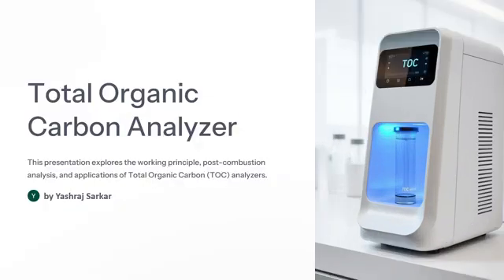Good morning, everyone. It's a pleasure to have the opportunity to present an in depth overview of the total organic carbon analyzer. So, this presentation will explore the working principles of the TOC analyzer, the detailed post combustion analysis process, its diverse applications across various industries, and technical considerations that highlight its advantages and limitations. So, let's begin by understanding what TOC analysis is and why it is vital for many industrial processes.